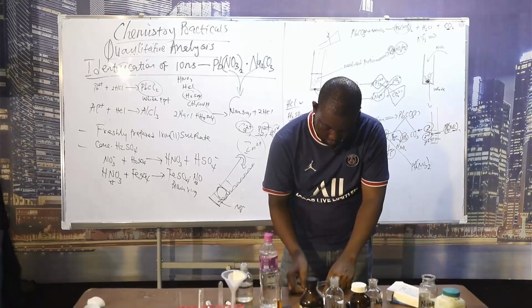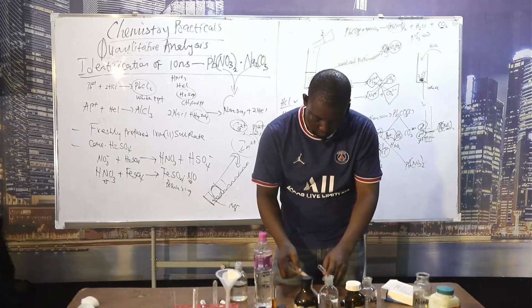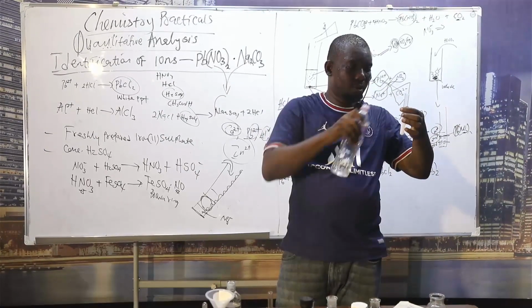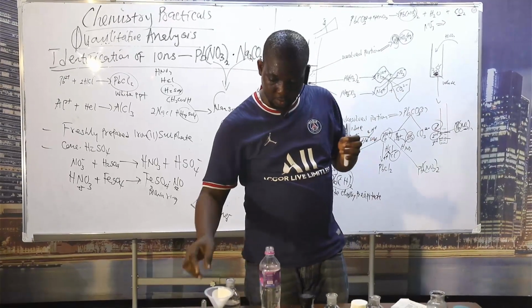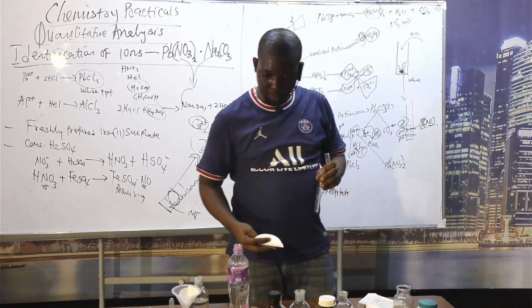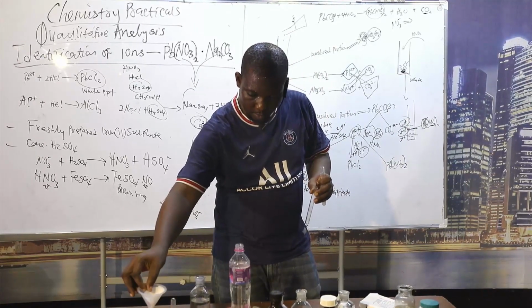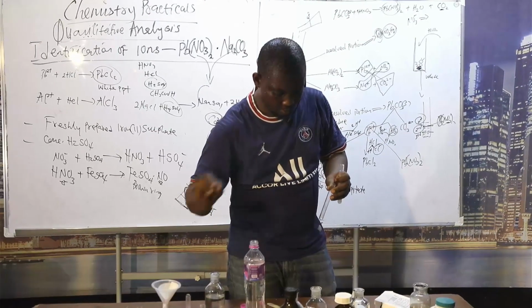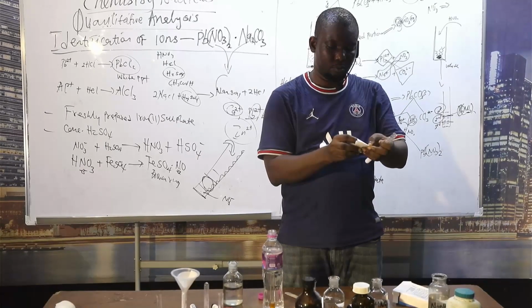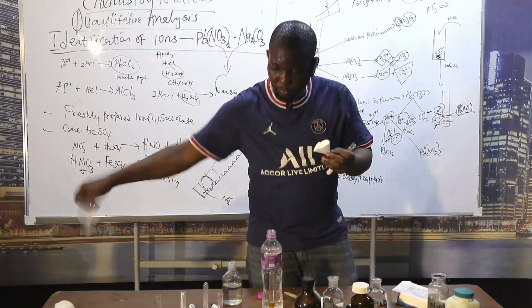That means that is too much. Take a small sample again. This is it. While you wait for this one to drain.